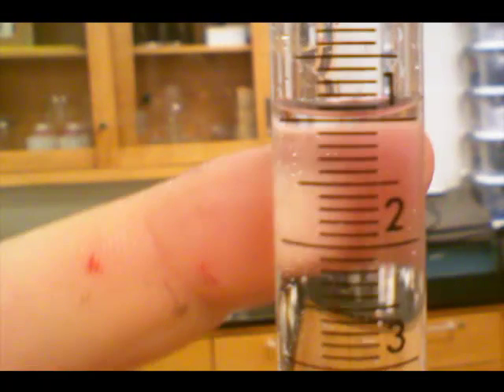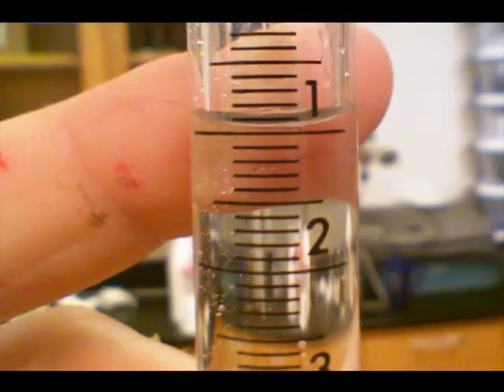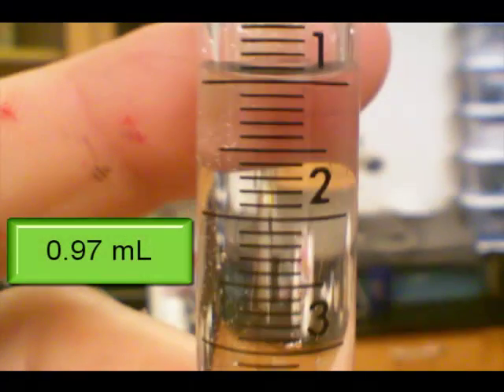A few things about reading these burettes. You want to read the bottom of the meniscus, for one thing, and the other thing is the numbers get bigger as you go down because we're measuring how much has gone out. So this looks like it's not quite 1. I'm going to call it 0.97 milliliters. That's my starting volume measurement, and I'll make a note of that.